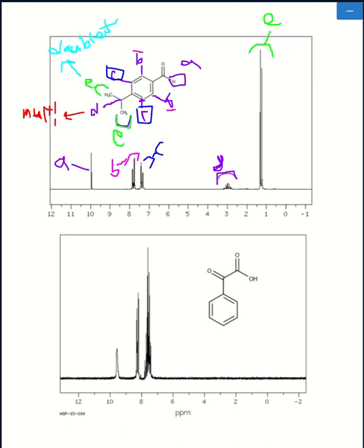So, cool. That would be a more complex way of identifying all of those guys. And again, assuming that you are more or less brand new to this stuff, let's just take this out. This carboxylic acid has 1 hydrogen.